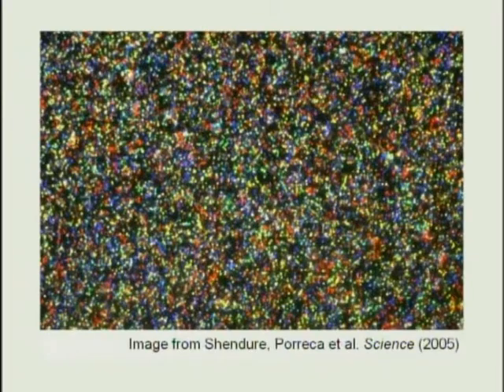So this is actually an image from my PhD work. These are 1 micron beads that are lit up one of 4 colors. And again, this is approximately 1/10,000th of the area of a microscope slide.